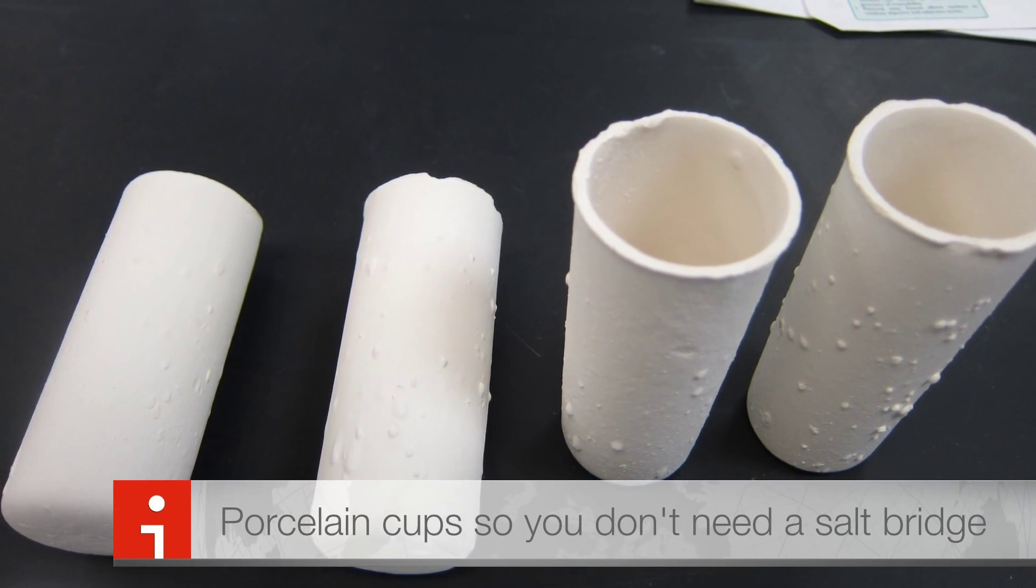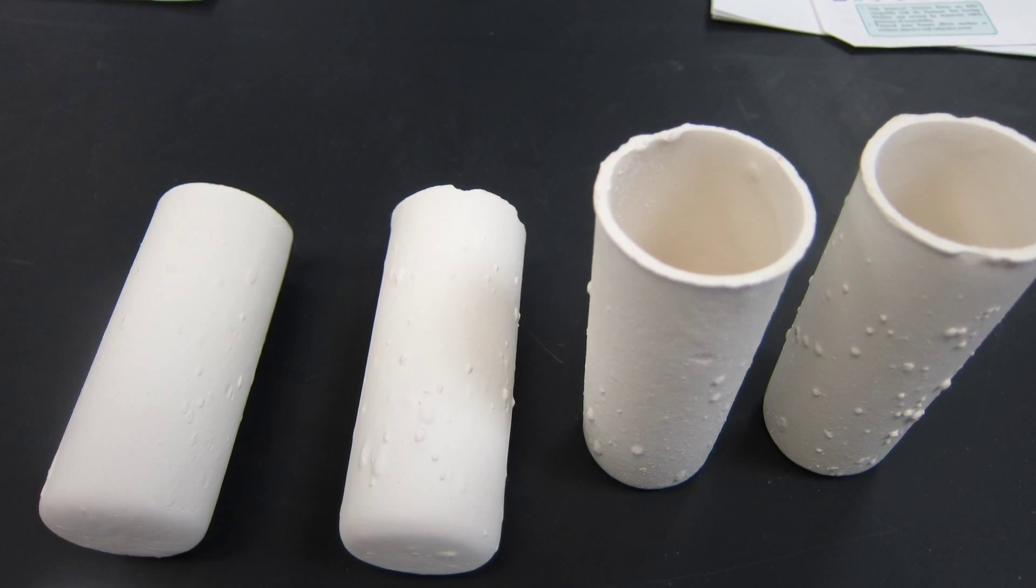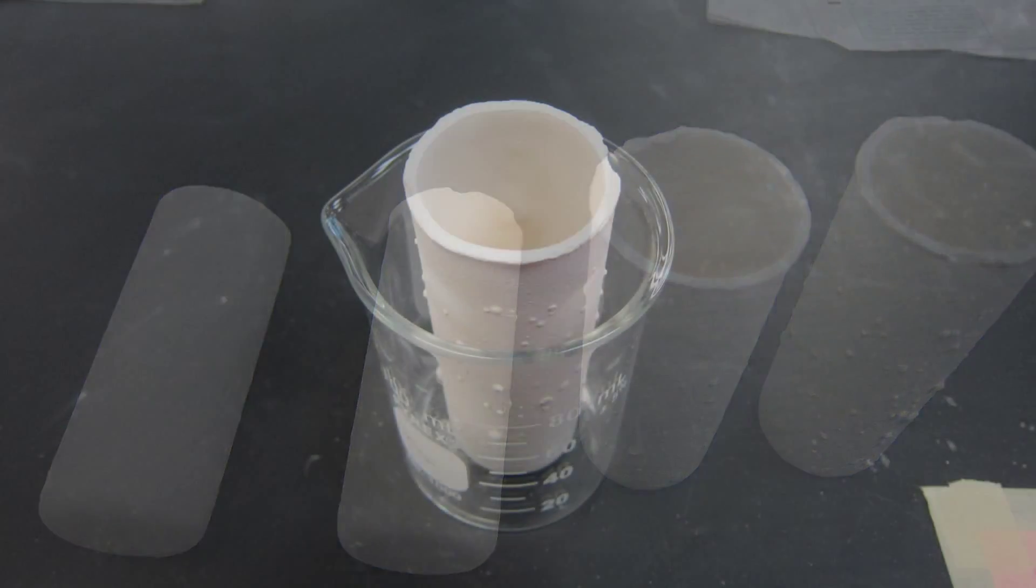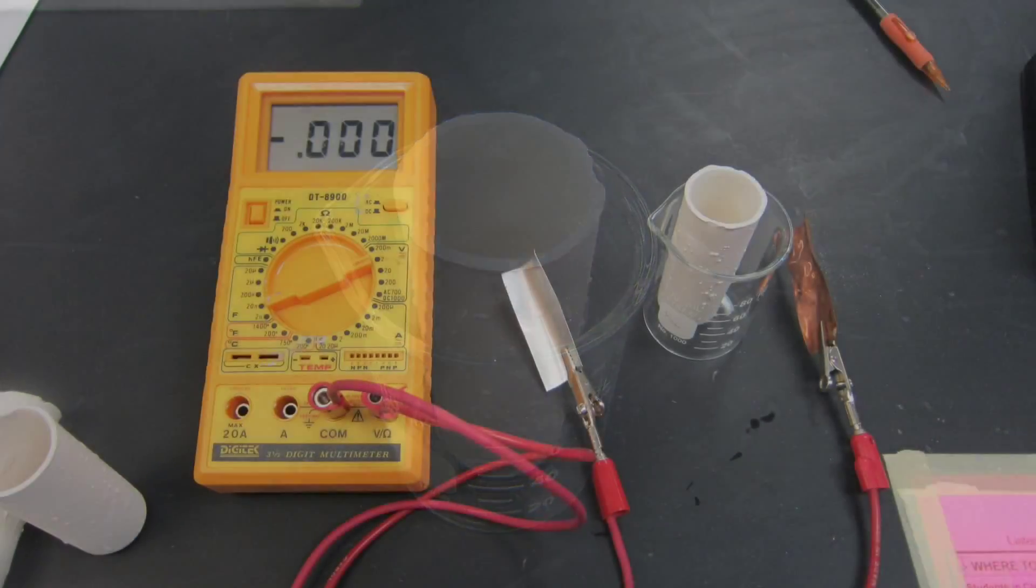The next thing that you will need is porcelain cups. We are not going to use a salt bridge. Instead, we will use the porcelain cup to set up the anode and the cathode will be placed in the beaker.